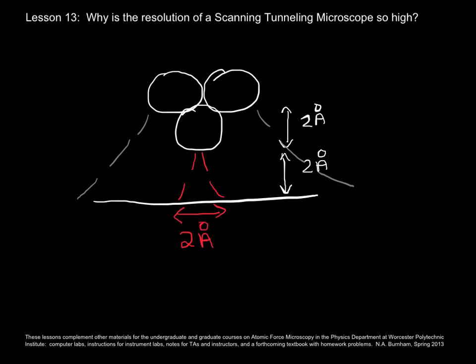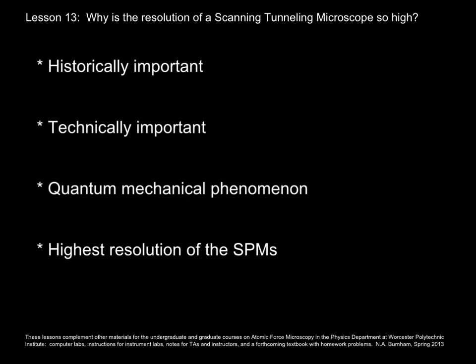In conclusion, I hope you now appreciate the historical and technical importance of STM and how it's based on a quantum mechanical phenomenon that I did my best to explain in a conceptual way, and how that phenomenon leads to the highest resolution of the scanning probe microscopes. I hope you have some time to go online and find some examples of STM images. I think they're really cool.